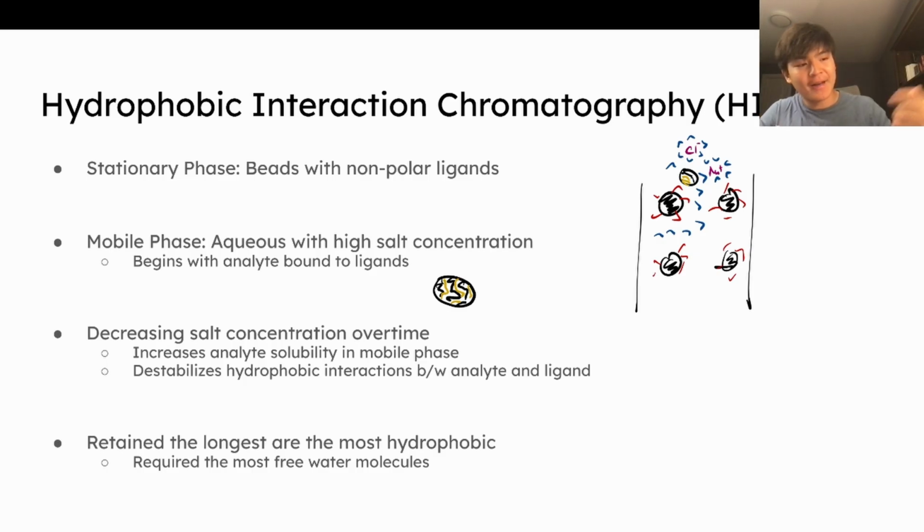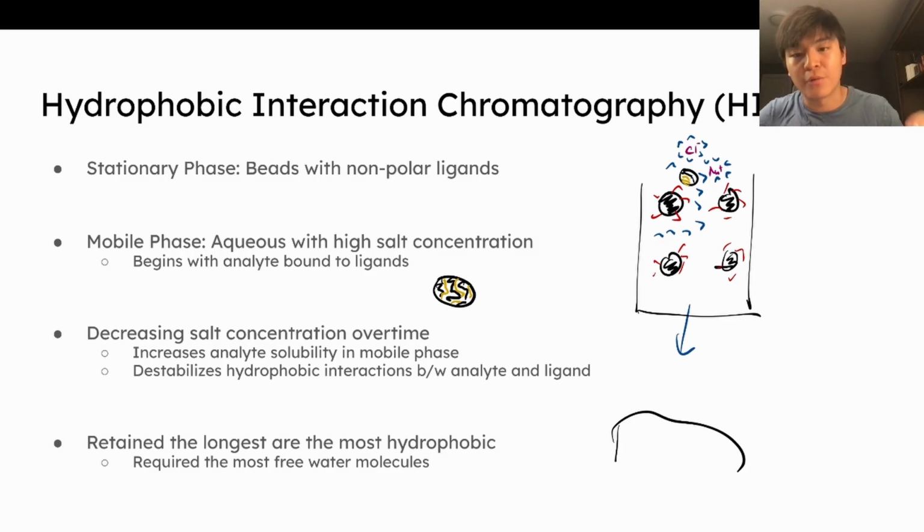We're going to now add in a buffer, or obviously water's leaving here. We connect this water to, basically titrating this, and we're getting a bunch of stuff leaving. We're going to start adding a buffer with 0% salt concentration, or something very low. What's going to happen is that these ions slowly disappear. Not disappear, but now there's not as much Cl. What's this water going to do?